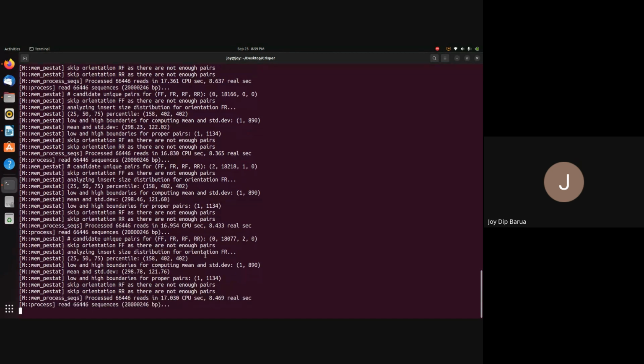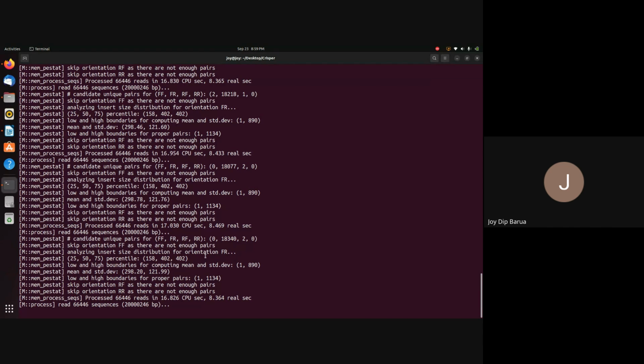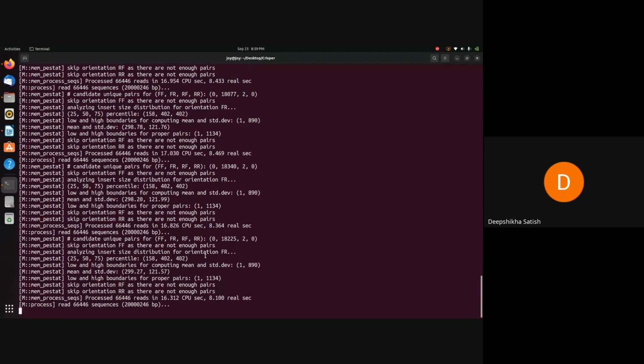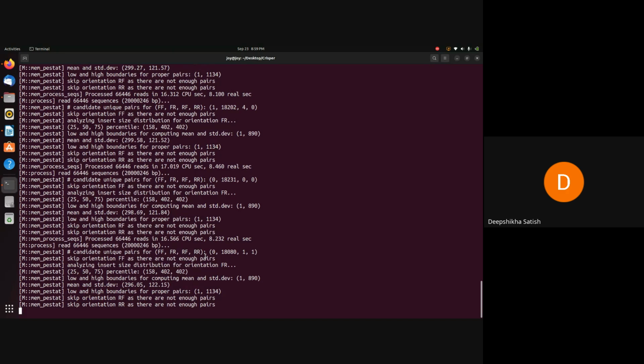Ma'am, I have one question. Yes. So we are performing the germline mutation here, right? But why not the somatic mutation? It's just your choice, because I told you the algorithm for the somatic as well, right? Mutect2. It's just that instead of HaplotypeCaller, you need to change that name. And germline variations are transferred from one generation to another, right? So that's why we are interested right now in germline, but it's not necessary. You can call Mutect2 as well.